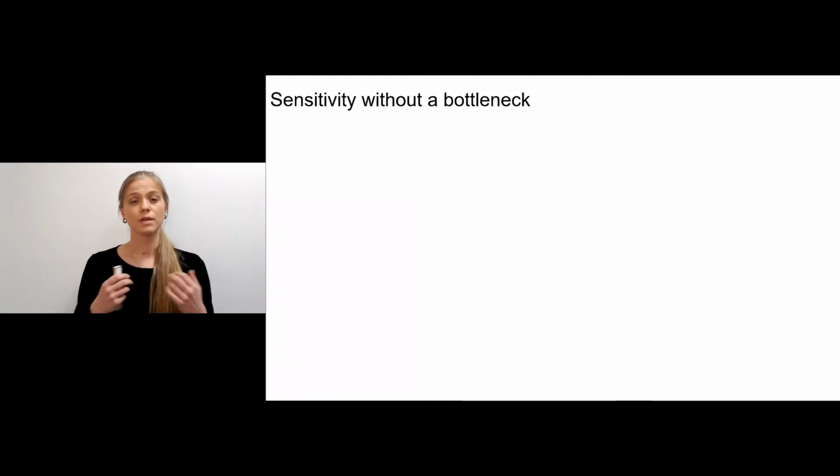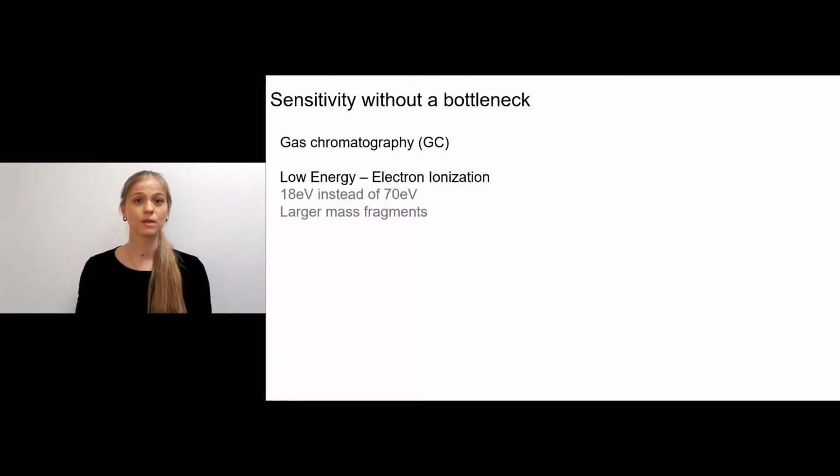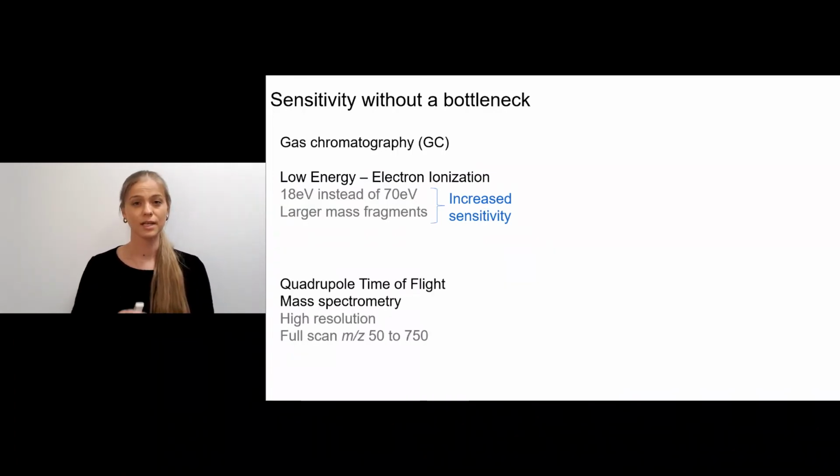Now, the instrumentation that we use has the capability of using soft ionization that induces larger mass fragments, and therefore it has increased sensitivity. For the detector, it is run in a full scan mode, and therefore we can include a virtually unlimited number of compounds.